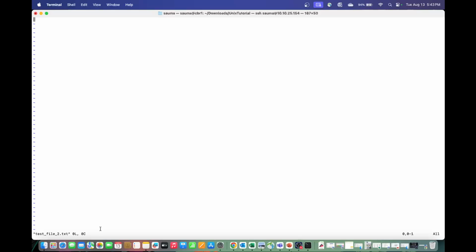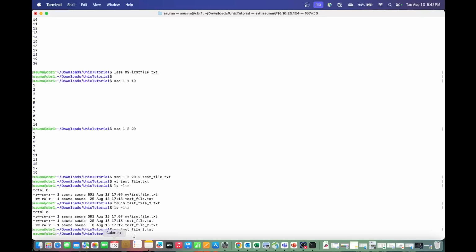What you want to do is basically create multiple files at once, then after that you want to edit them one by one. That is when you use touch. So touch will create these multiple files, but all of them will be empty. Just remember that. Okay, so this is touch.